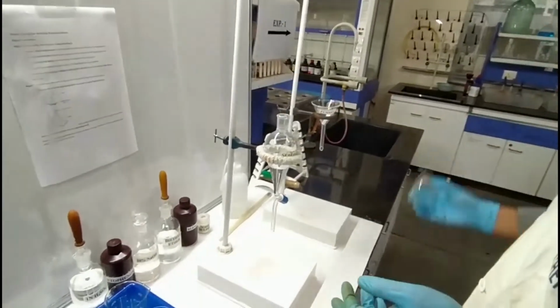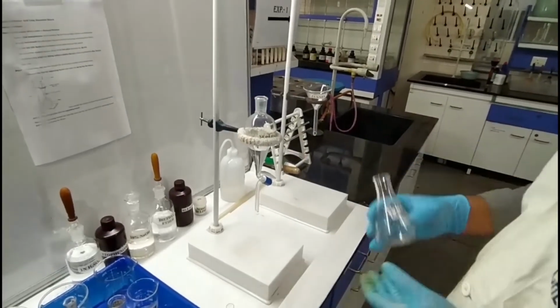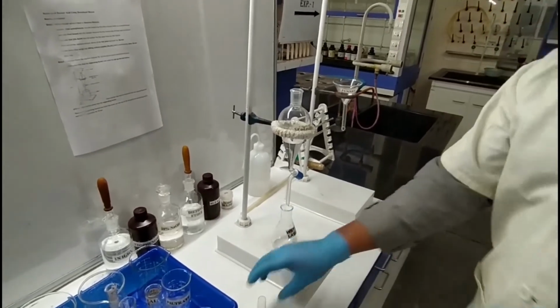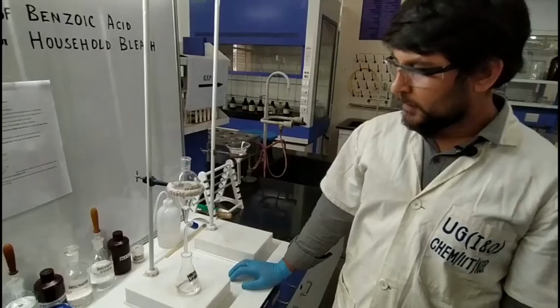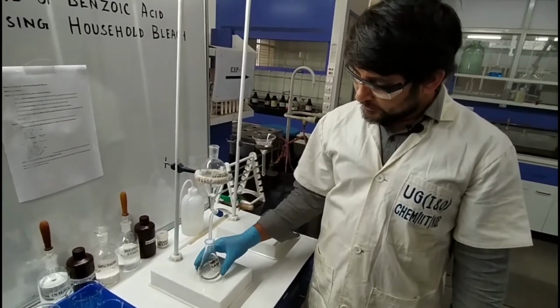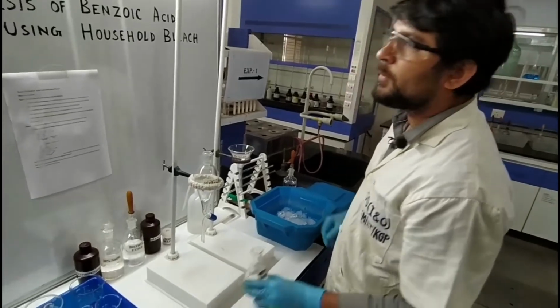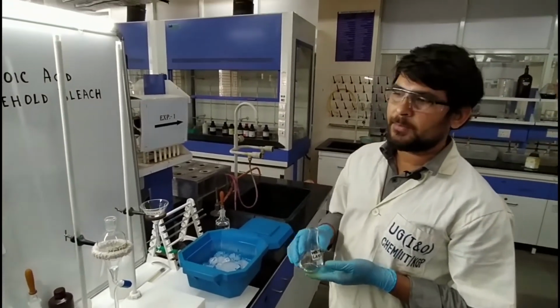Okay, this is the conical flask. I am going to transfer the aqueous layer into the conical flask. So all the aqueous layer, the lower layer, we have already transferred into the conical flask. Now, as I told, the sodium salt of benzoic acid is present inside the aqueous layer.